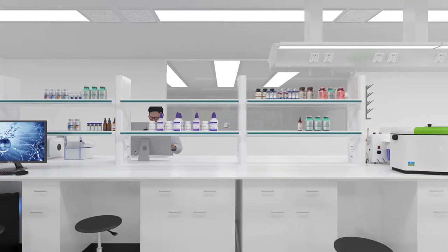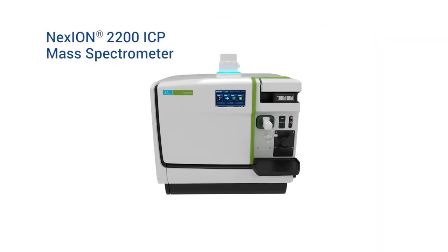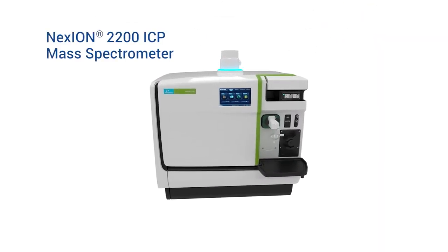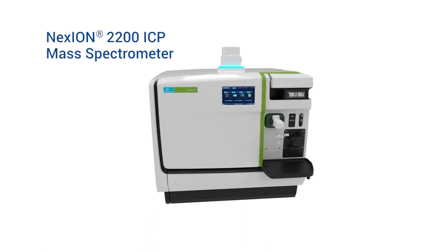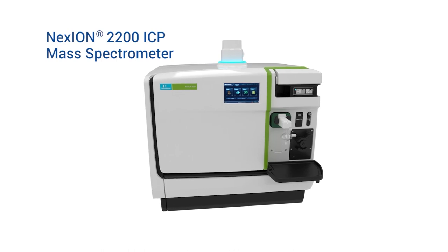But not every ICP-MS is created equal. Enter the NexION 2200 ICP-MS from PerkinElmer, your trusted partner in ICP-MS technology for four decades.